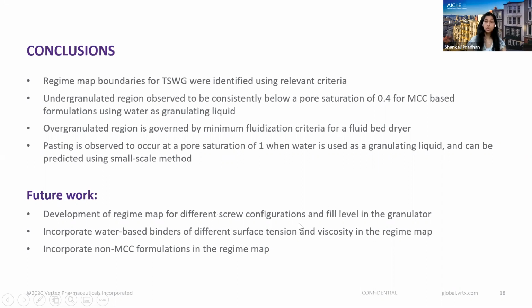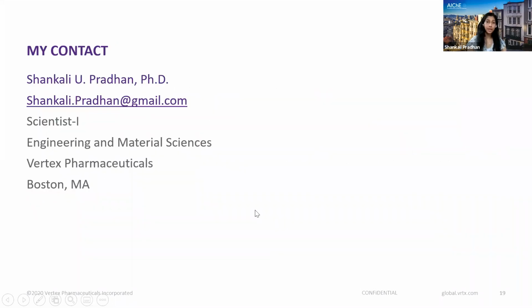We need to incorporate different screw configurations and fill levels in the granulator. We also need to incorporate different water-based binders with surface tension and viscosity, as well as different formulations that are even non-MCC based formulations. With that, I'm ending my talk, but I'm open to questions.